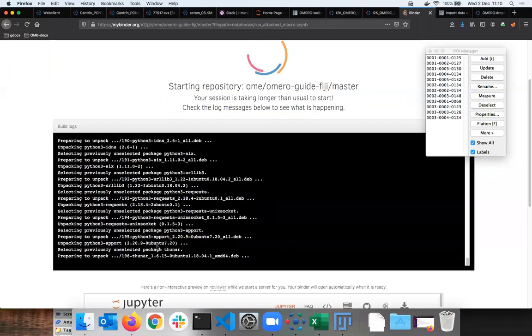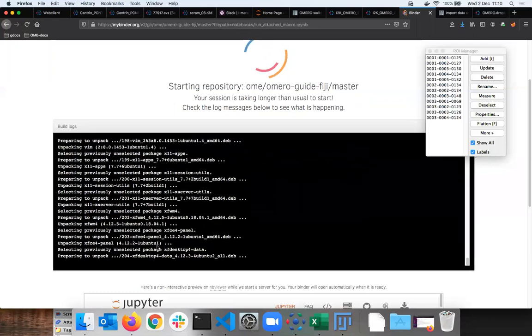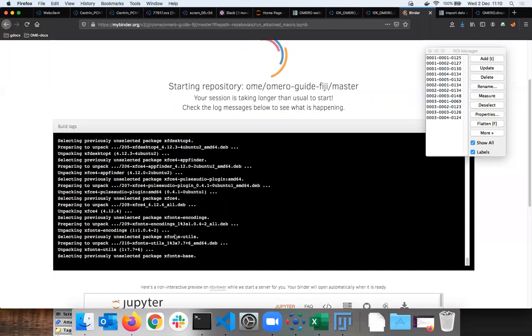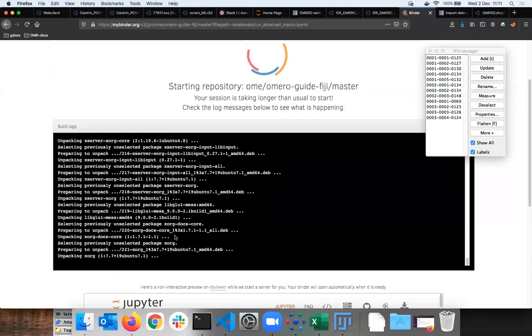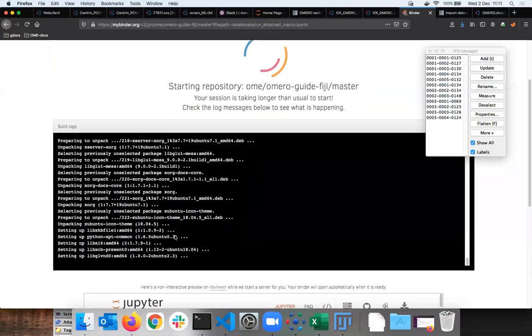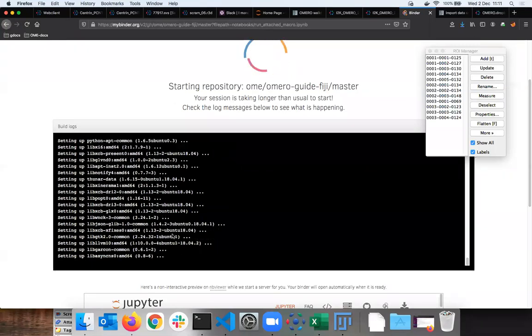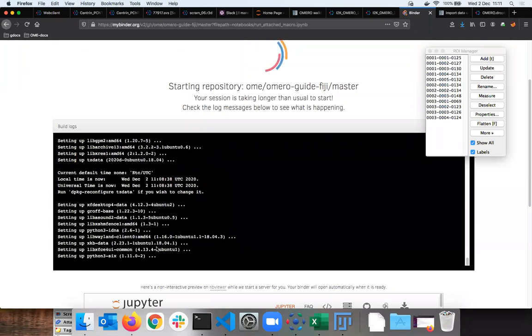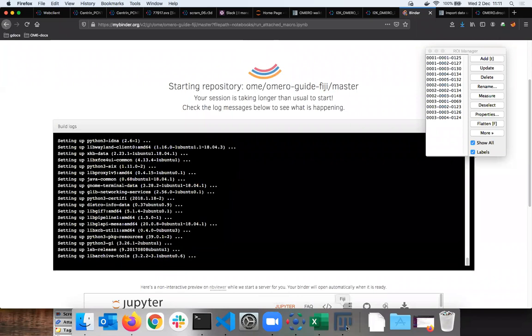Now I can go one step further, which we plan to do in the future, and have the cloud place simply closer to my server, something like having it on the cluster or something, and have the analysis run close to where the data sits, so that the transfer of the data between those two places is not so long.